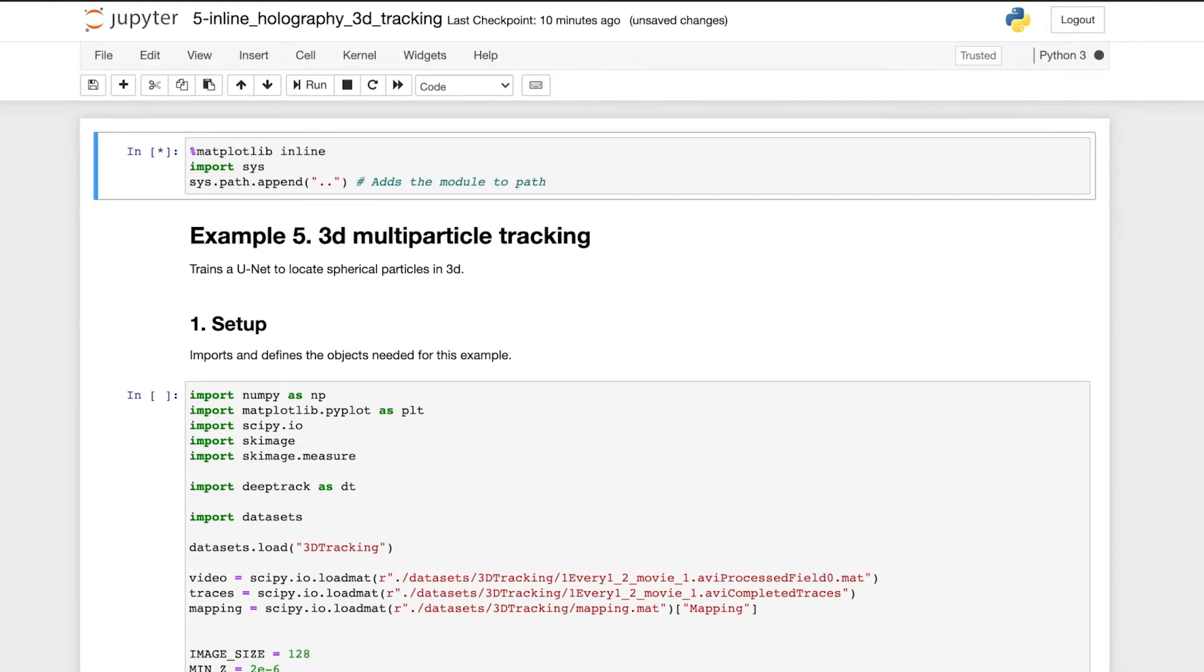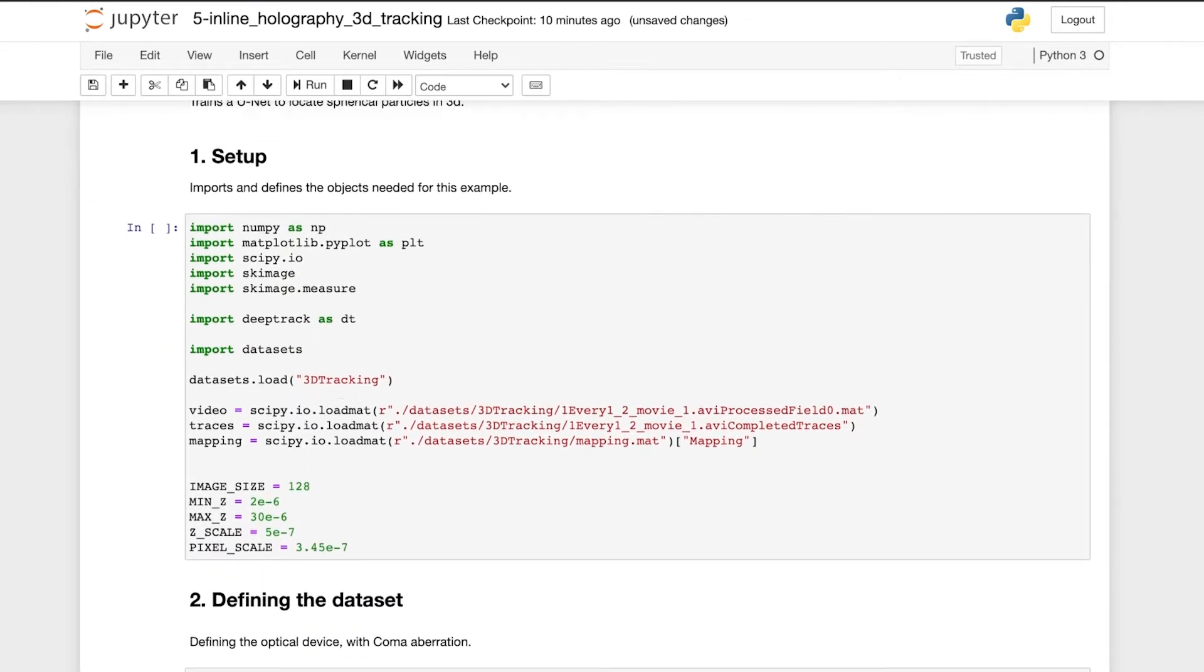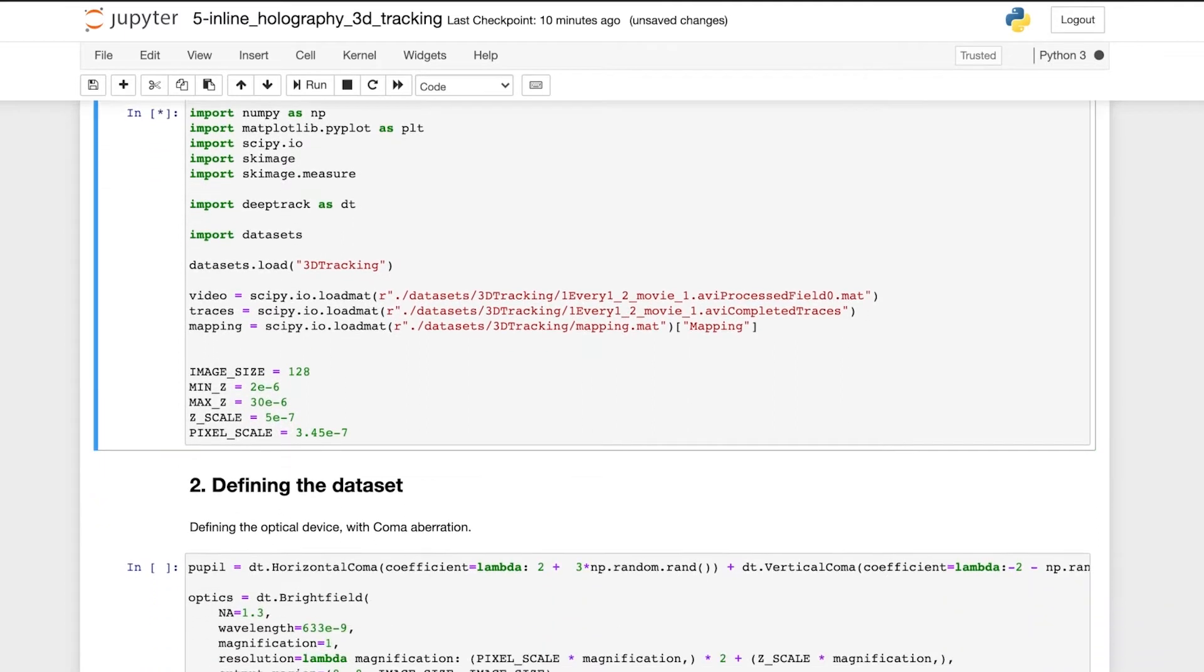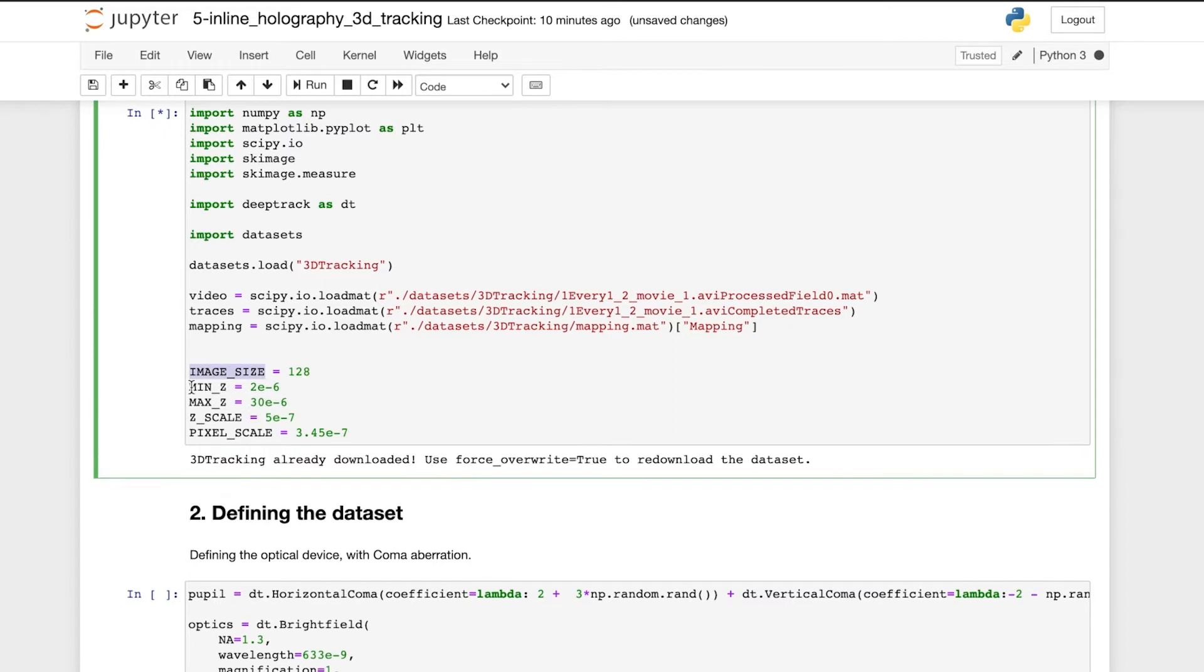First, we import the objects needed for this example, and we load what we need to evaluate DeepTrack later. Here, we also specify the size of the images the network will be trained for, as well as specifying the optical properties of the images.